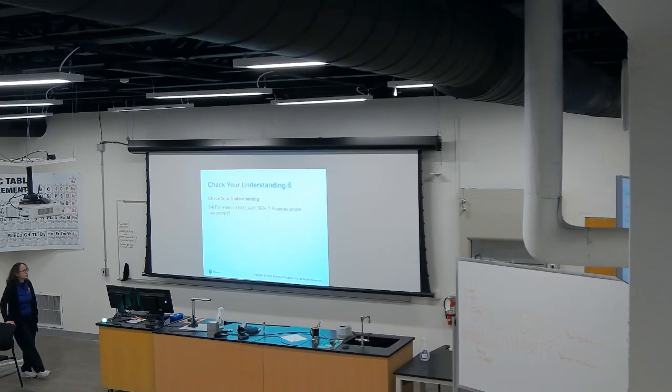So what is TEM used for? SEM and scan probe microscopy. And TEM, what do you use it for? Things like viruses or organelles, not too small for that. Mm-hmm. And SEM?